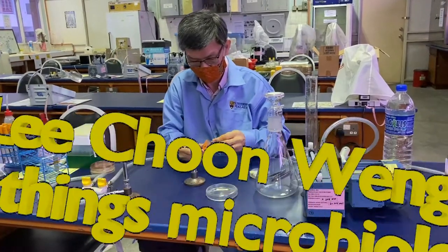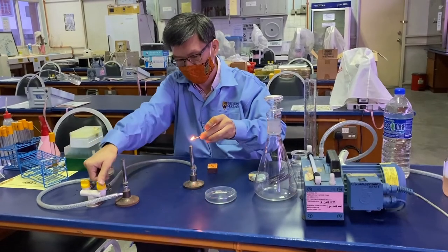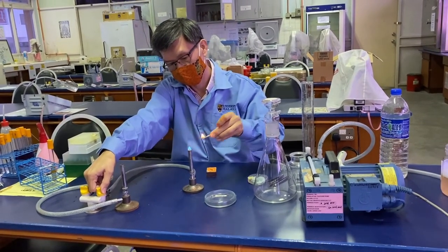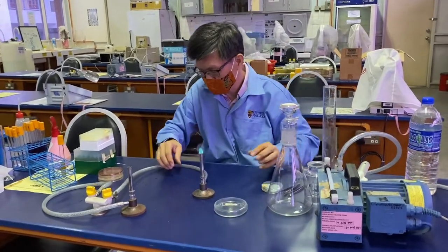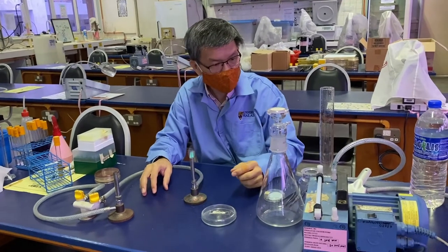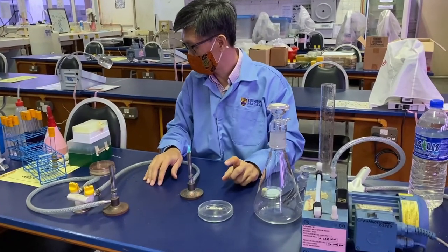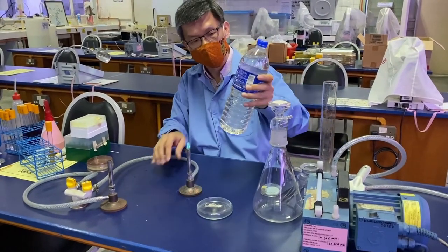We will be doing the membrane filtration technique. We will be working near the Bunsen burner to create an updraft to reduce any potential contamination from the air.